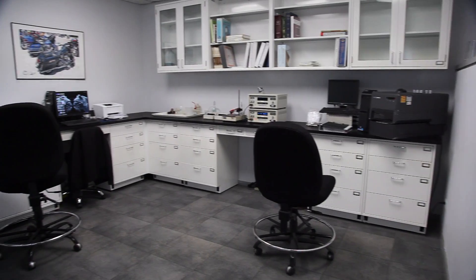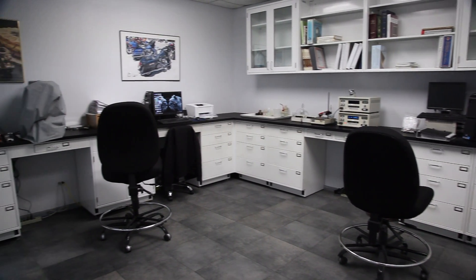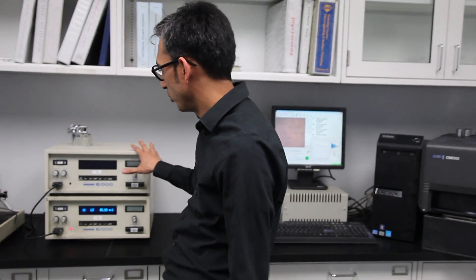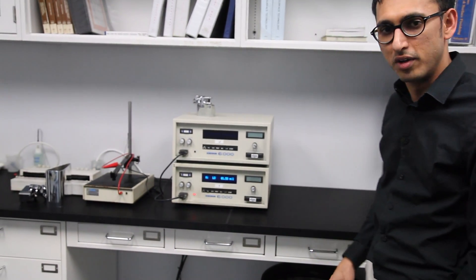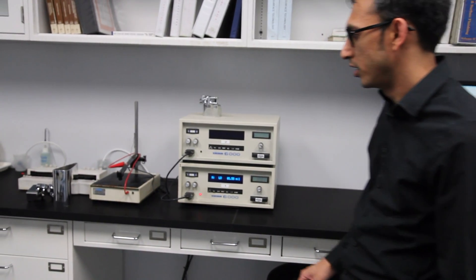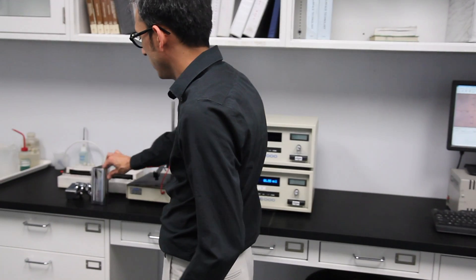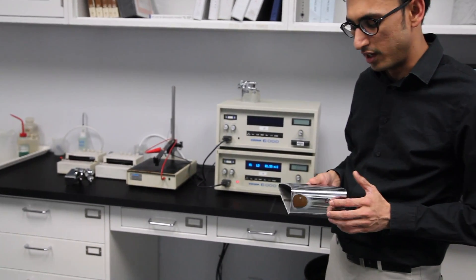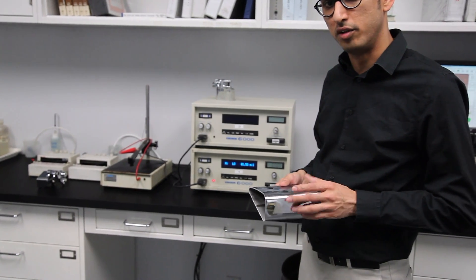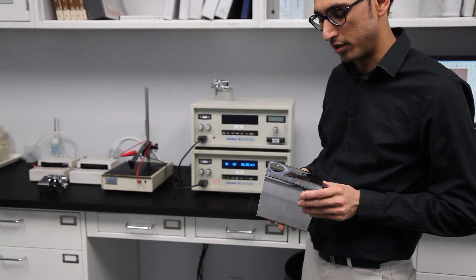The equipment you're seeing here is a coker. The coker is used to do step as well as thickness on the part. We utilize that to determine the total thickness on our electroplated deposit as well as the millivolt potential differential on the part.